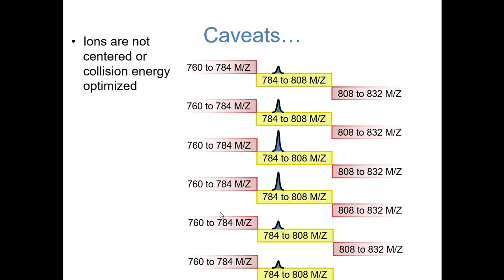Yeah. So what's the issue with that is, that's absolutely true. One of the things that is a problem here, though, is we're co-acquiring many peptides at the same time. And so charge state becomes a problem because we have to make an assumption about what the charge state of our peptide is.